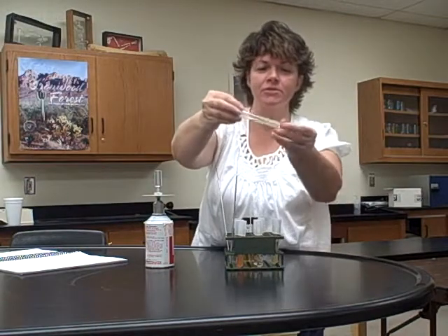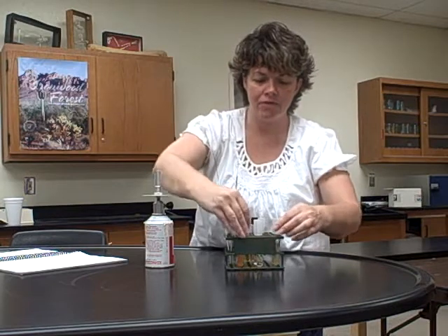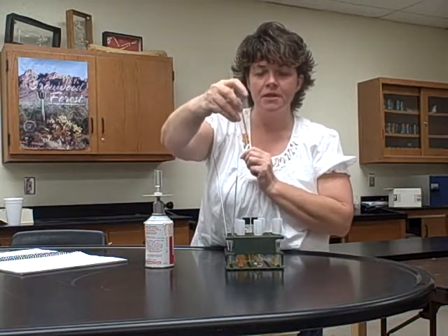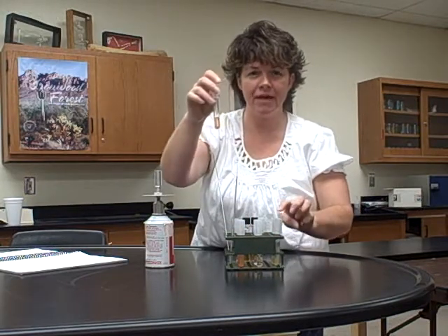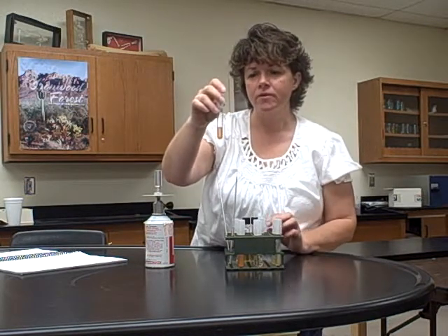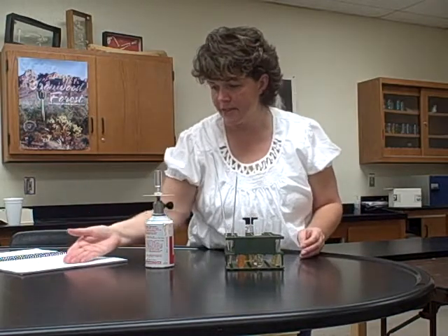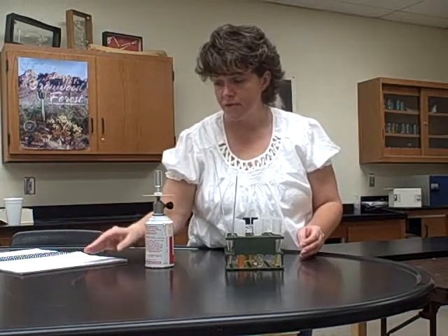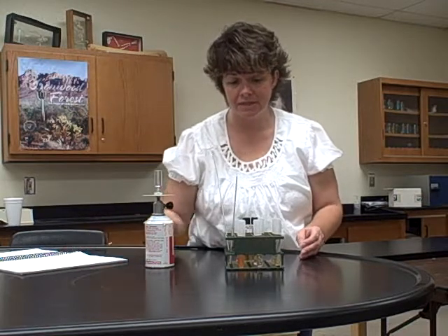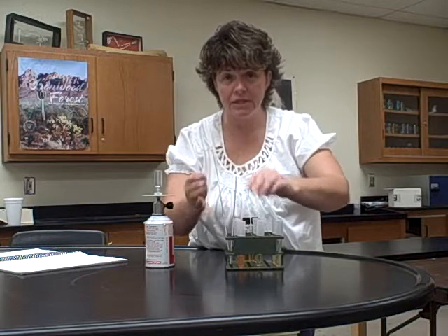Then we have the slant, which we've seen before, it's a solid, okay? And then we have what are called semi-solid agar deeps. That means they're solid, but they don't have as much agar in them as these do, so they have a little bit of pliability, okay? Now in your picture, it shows that you're putting the Lactococcus lactis into the 3 separate tubes: the broth, the slant, and the deep, okay? And then you're going to put the other 2 bacteria into each of the 3 tubes.